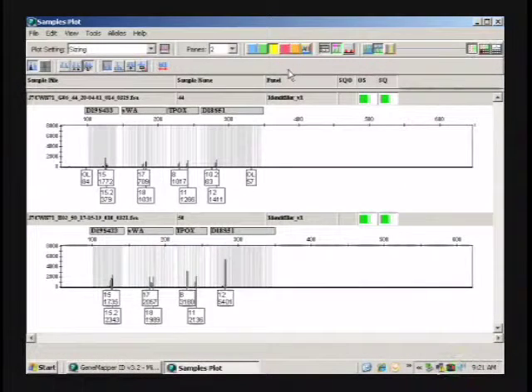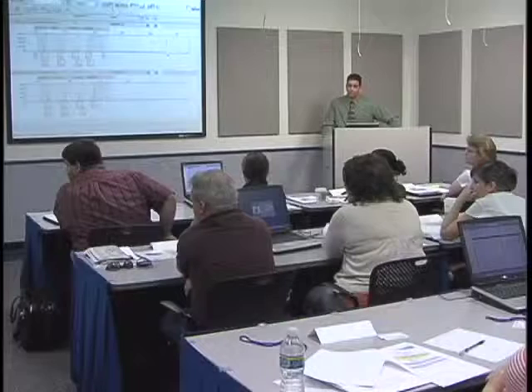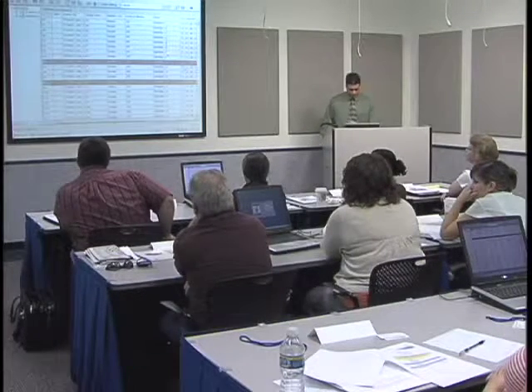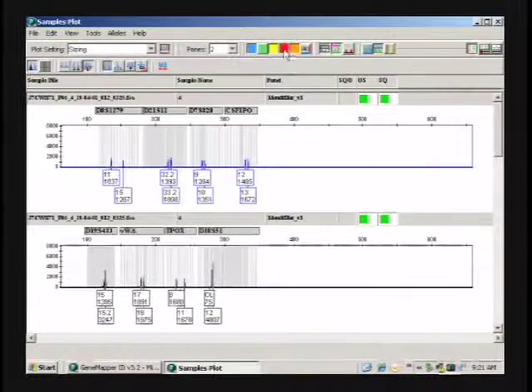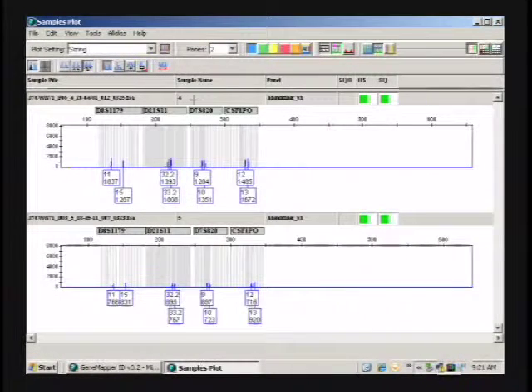Now, I didn't see that when I did it, but Melissa, what was your other one, the 0.1 nanogram that you did 2 washes on? 4 and 5 would have been a 1-wash one. So 4 was 2 and 5 was 1. Well, in this case, it seems to be the reverse, where number 4 was 2 washes. 4 was 2 and number 5 was 1 wash, and 4 is definitely higher than 5. 4 looks like approximately double.